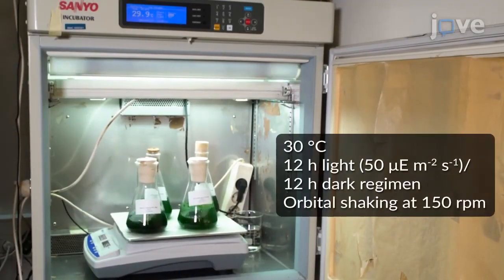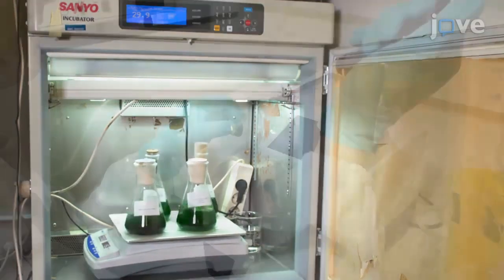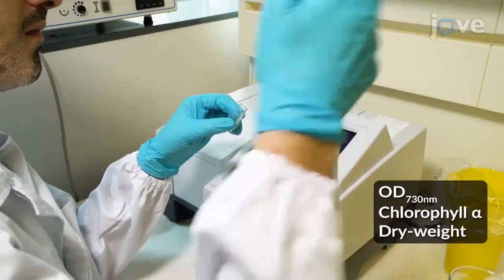To begin, cultivate the cyanobacterial strain under standard conditions. Measure growth using standard protocols.